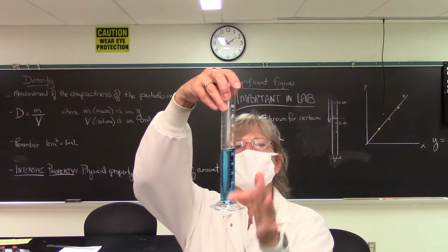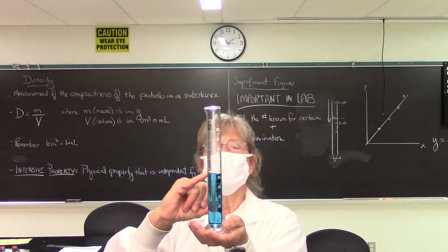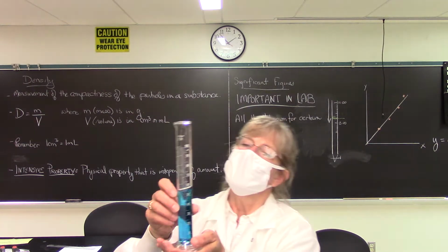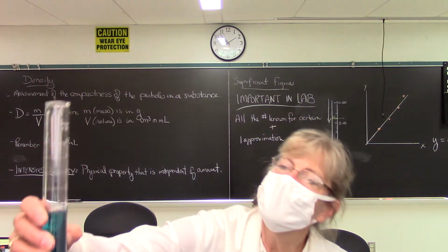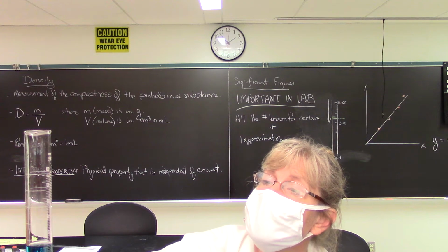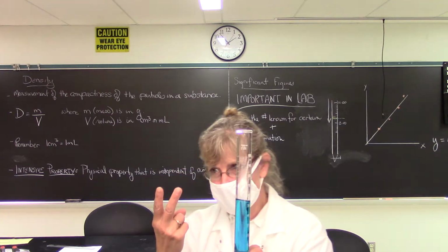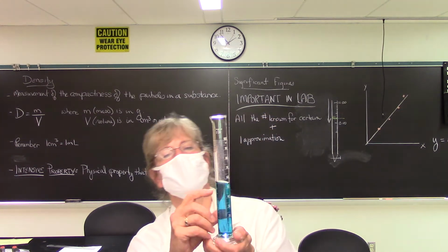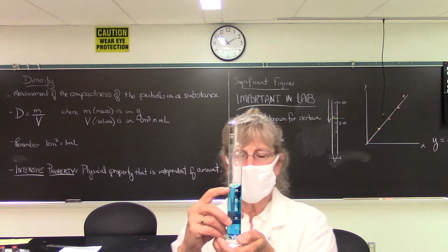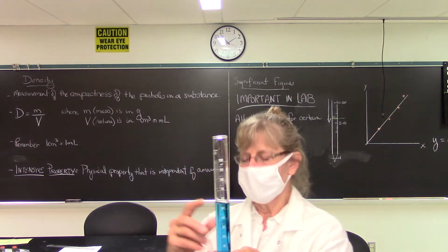So first of all, this is just food coloring so that hopefully you can see where it starts. First of all, we'd fill up our graduated cylinder to a certain point. And in this case, I would look at you can't see it, but I can. The volume of this is 54.8, using my proper significant figures, two known for sure, 50, and then 4 lines up, but the meniscus is just shy of 55, so it's 54.8, and I'd write that down.